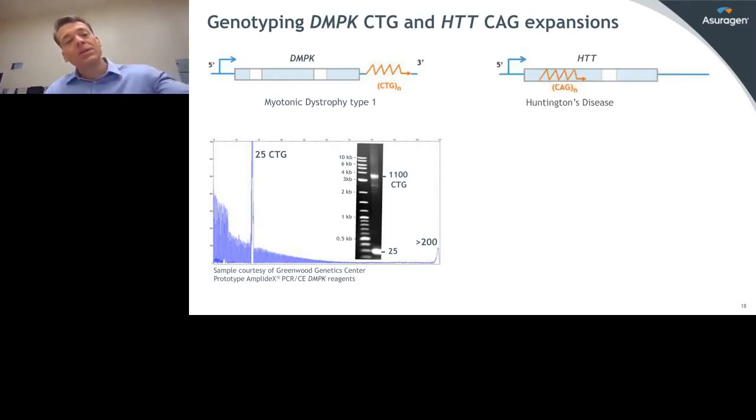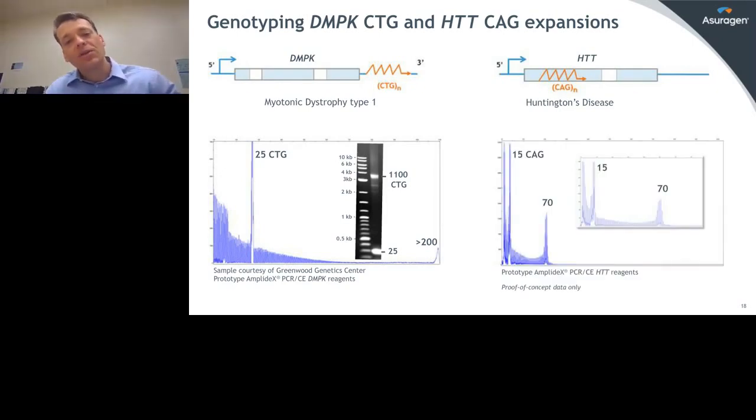Again, the ability to see the longer products is within the PCR, just outside of the reach of the platform in this case. And what that looks like is shown here in the agarose gel, out to 1100 CTGs, which we can very clearly differentiate here. So we have the capability to reach out quite a bit of distance to be able to size these alleles, depending on how we resolve them downstream.